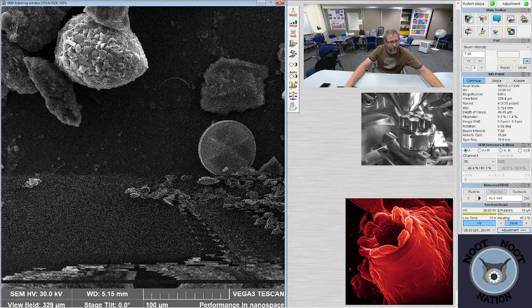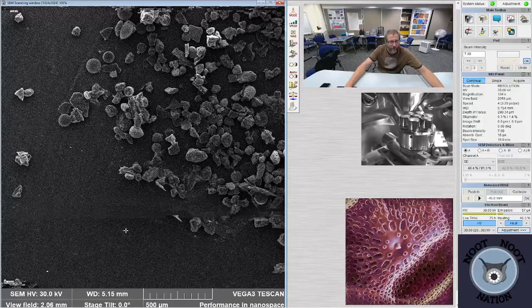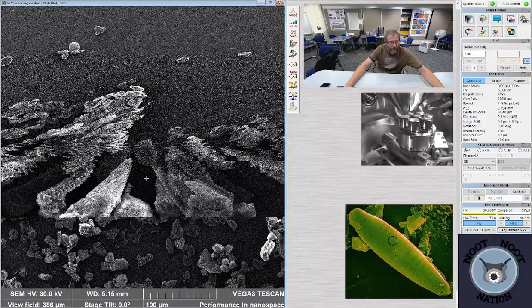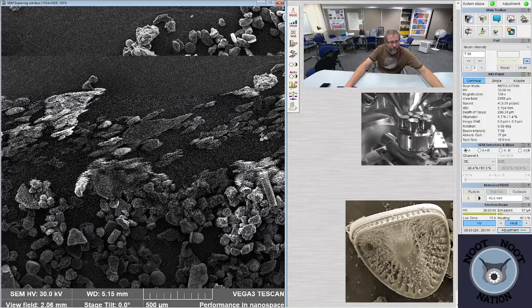So there's one, that's a diatom. There's another one right there. Sometimes I'll prep these samples and then not process them. We just rinse them to get the salts out, so that we can see things that would fall apart if we put them into nitric acid. It gives us a different view of the materials and what kinds of organisms are in it.